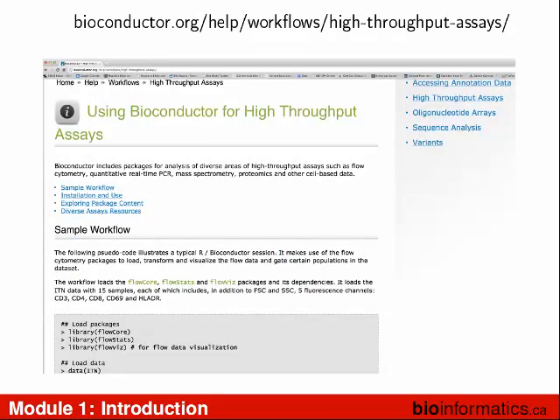So this is where flow lives. There's some examples in here, this was written about 2 or 3 years ago, but they had the flowCore package there, a lot of the basics. And so this is a different way that you guys can walk through and get reinforced with some of the things that we're going to teach you. I forget the name, it's a name like that. Nishant. Look for the packages that Nishant, or the descriptions that Nishant did. They're really, really good for how to use flow, some of the basic flow packages.